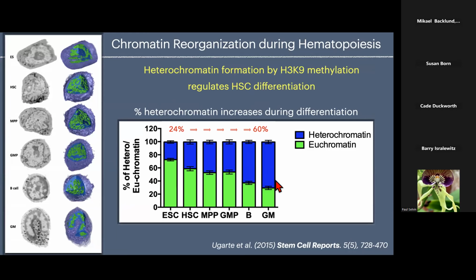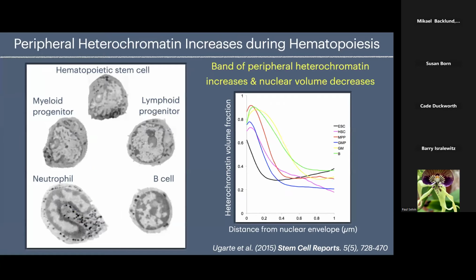The percent heterochromatin increases tremendously as the cell differentiates and genes are turned off. Now remember, it's percent heterochromatin. The volume of the nucleus is decreasing, and so heterochromatin content itself isn't really increasing that much. It's just that the volume of the nucleus is decreasing, and so you get a higher percent heterochromatin in mammalian cells. It's the exact inverse when you go from a normal to a cancer cell. You go from a small cell to a humongous non-differentiated cell in a cancer cell.